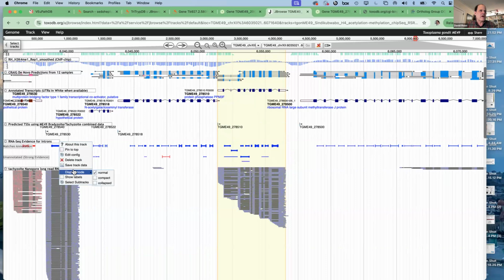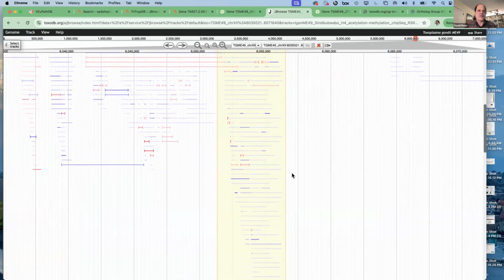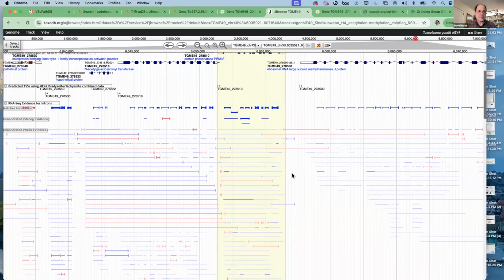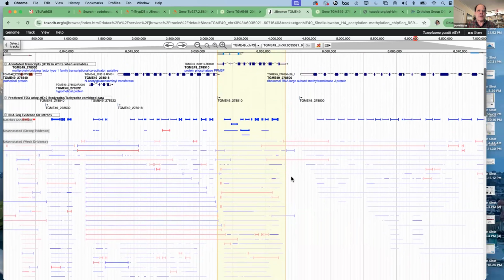But there are also, in deep RNA-seq data, very many more experimental evidence here that we're not talking about at all. And so there is reproducible evidence, for example, for alternative variants of this last exon supported by 17 different reads, or in this case, by 27 different reads, or in this case, by 517 different reads.